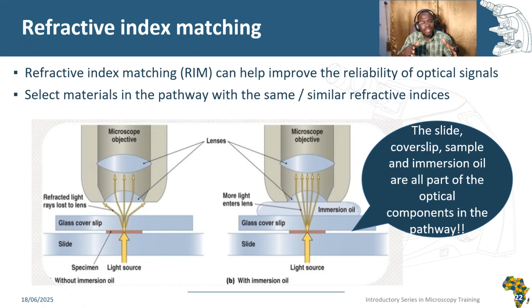If you look at these diagrams illustrating two aspects. One, viewing a particular specimen without oil immersion, and the second is viewing a particular specimen with oil immersion.